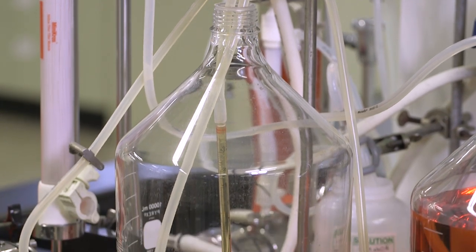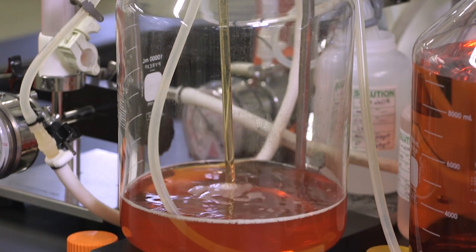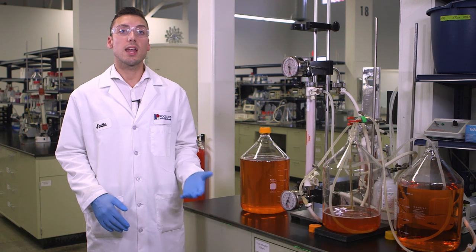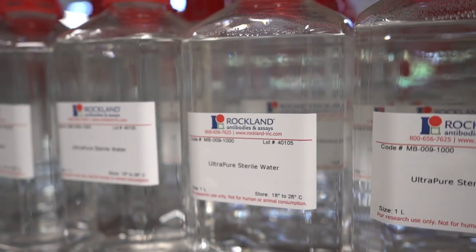We often check the efficiency of our column capillaries by running a BSA check on them to make sure we're not depleting any antibody protein when we're doing our production runs.